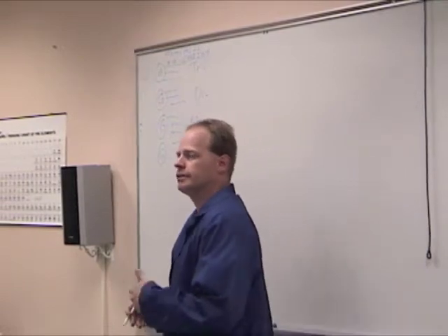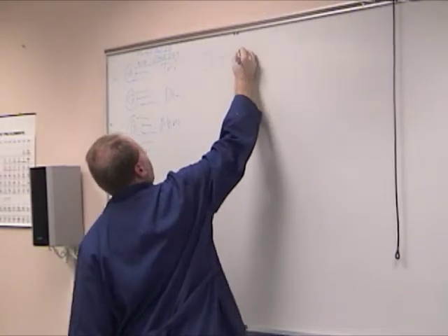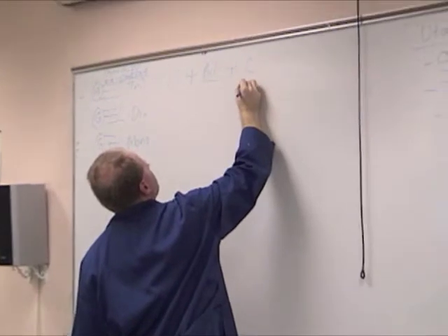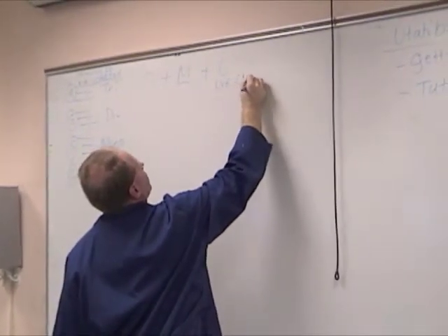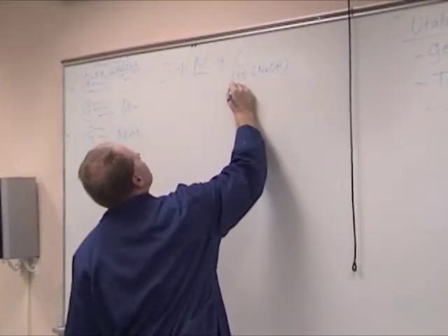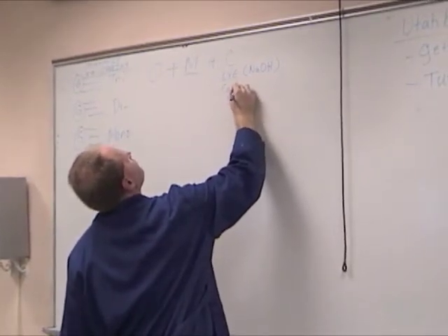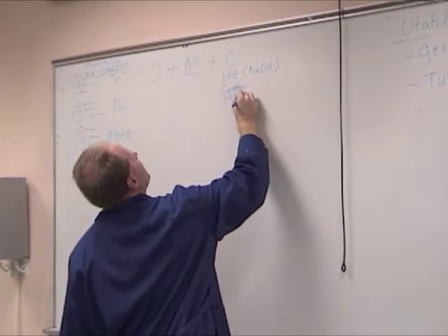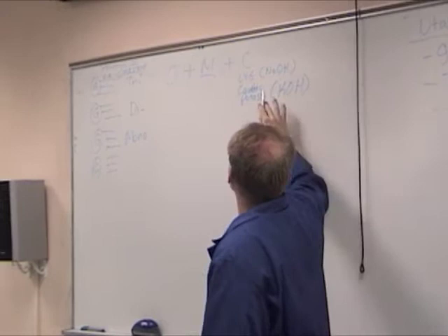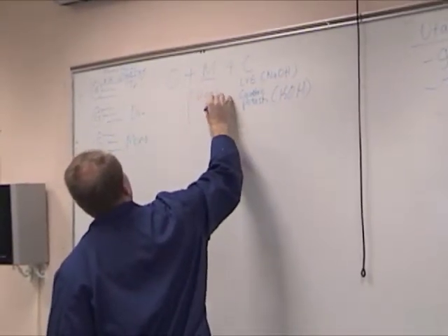To get biodiesel, all we do is just a basic chemical reaction. It's called transesterification, or if you're using sulfuric, esterification. You take oil, you add an alcohol. I'm choosing to use methanol today. And you use a catalyst, and you can either use lye, which is NaOH, its proper name is sodium hydroxide, or caustic potash, which is KOH, as my catalyst. And then I'm going to add two other things to this mixture, heat plus mixing.